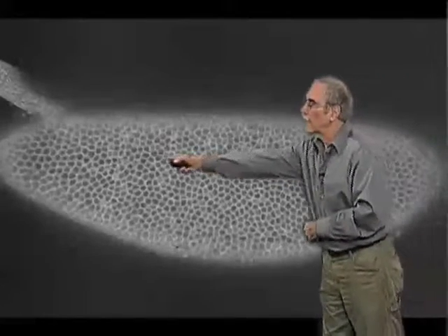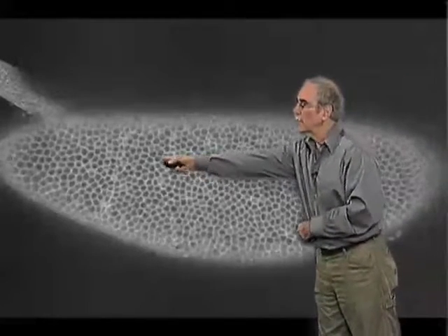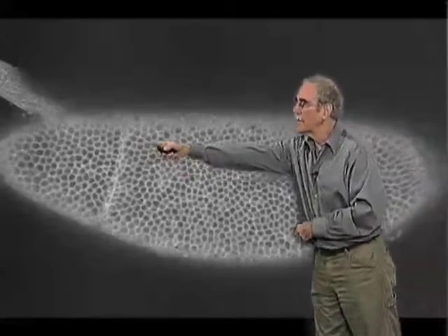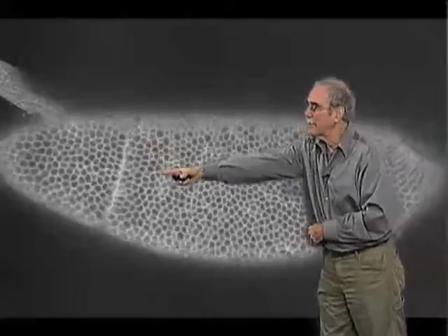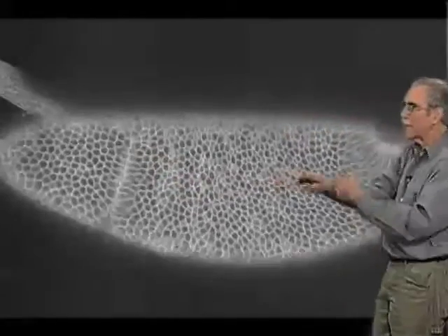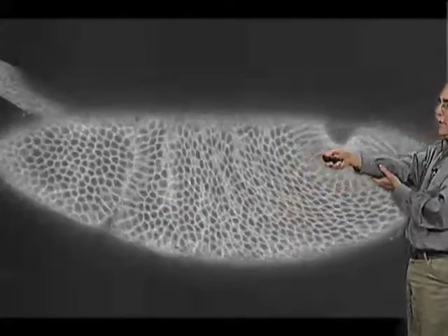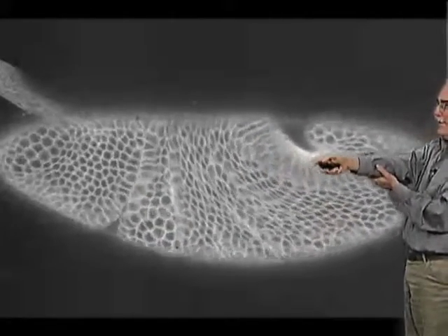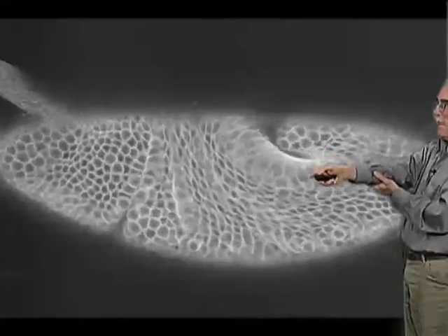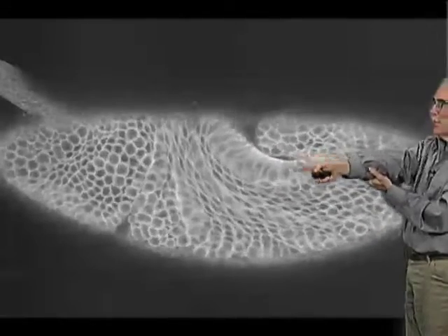Watch in this area here — all the cells are pretty much the same, but right about there you can begin to see this fold happening, and then you begin to see remarkable changes in the behaviors of cells.